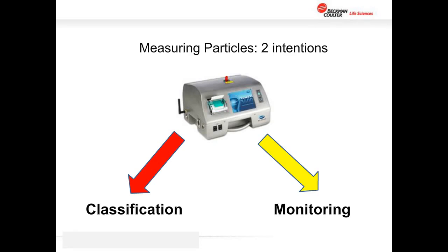That is something where you're testing more frequently, often on a daily or even continuous basis. These are really two quite different applications, but often using exactly the same instrument. So hopefully, as we go through this discussion today, that will become clear, and the appropriate use of the standard for classification versus other uses of different documents and procedures for monitoring will become a bit more distinct and clear.